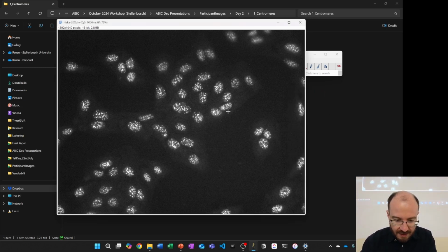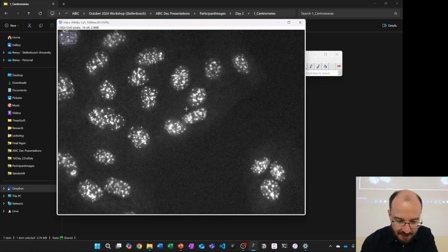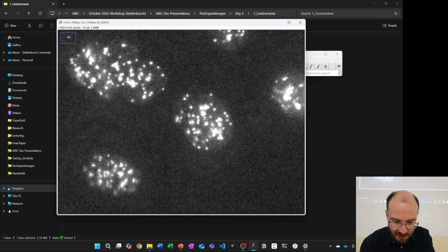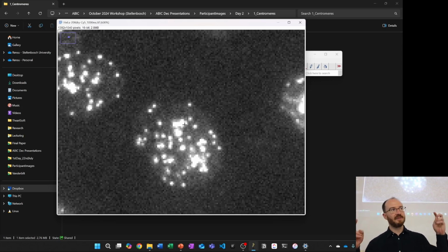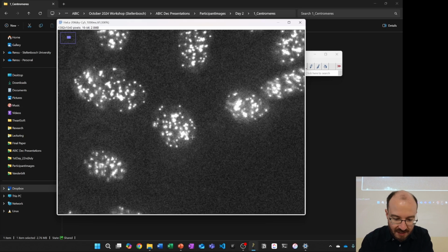Okay, now I must first think a little bit about what I am seeing here. I'm seeing little dots. Some of them are nicely separated. Some of them are connected to other dots in a denser region. If I see something like this, where they're obviously connected, I wouldn't be able to uniquely identify them, so my count will be off in that sense. So first of all, realizing my image has a limitation, I will not get an exact count. It's always going to be an estimate, but I can think about what that estimate might mean.